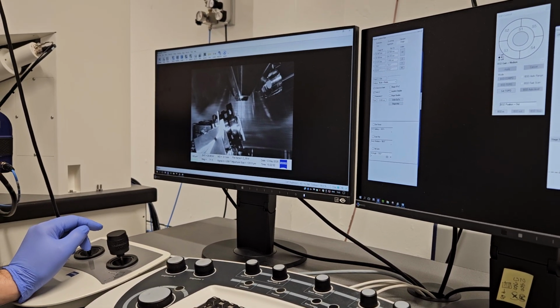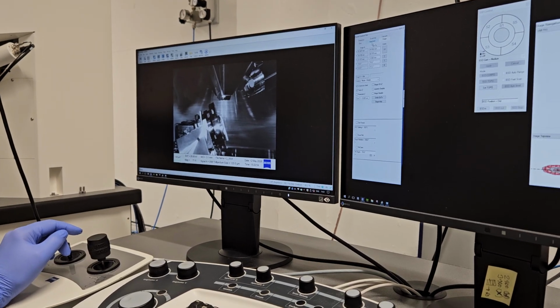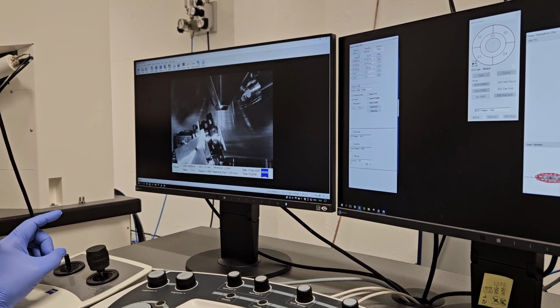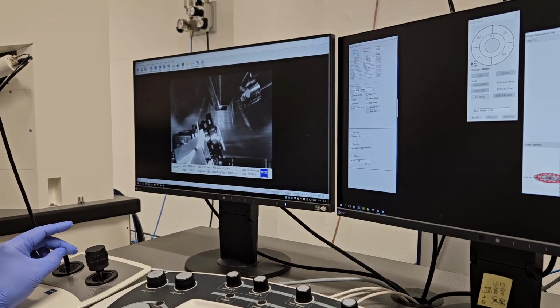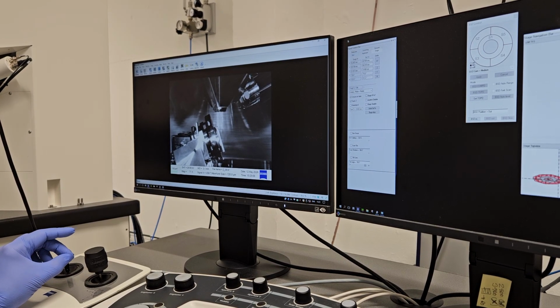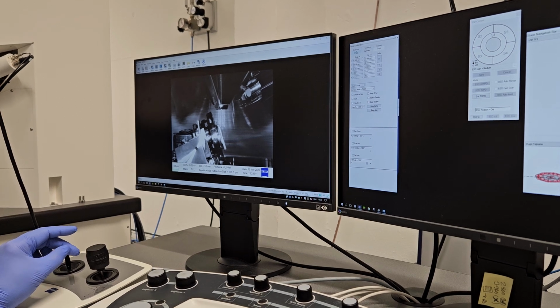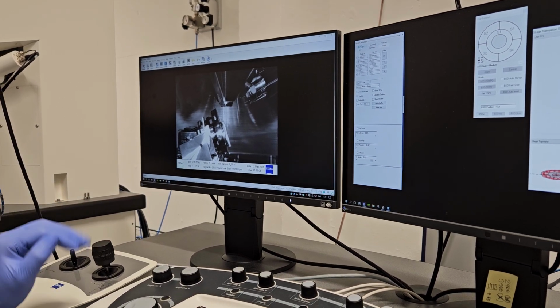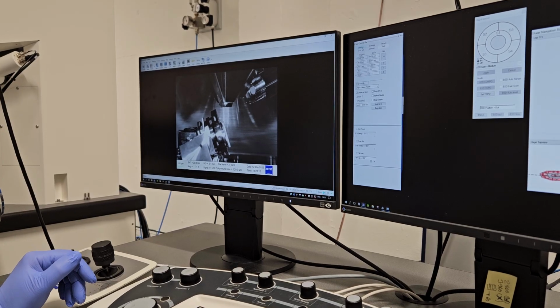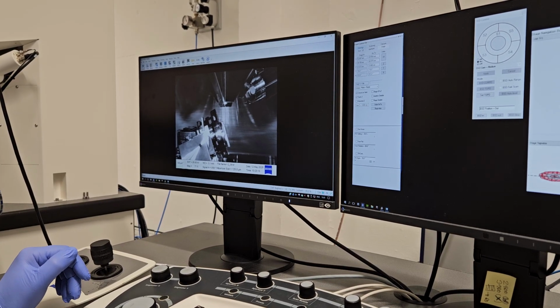How do you know if that distance is good enough? The recommended distance is 8.5. Again, it is not always possible to get it. 8.5 is recommended, but if you go slightly above or slightly below, it would still work. It's just not the optimal distance.